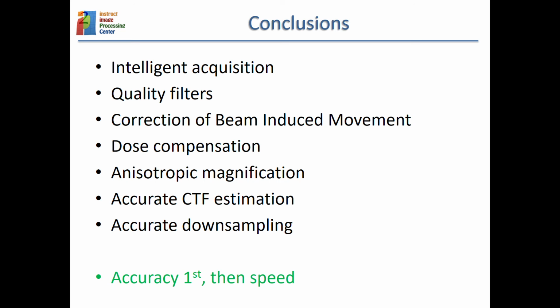And if you do downsampling, do an accurate downsampling. I would say that most of the packages now are doing very accurate downsampling. That was not the case a few years ago. And I would worry first about accuracy rather than speed.